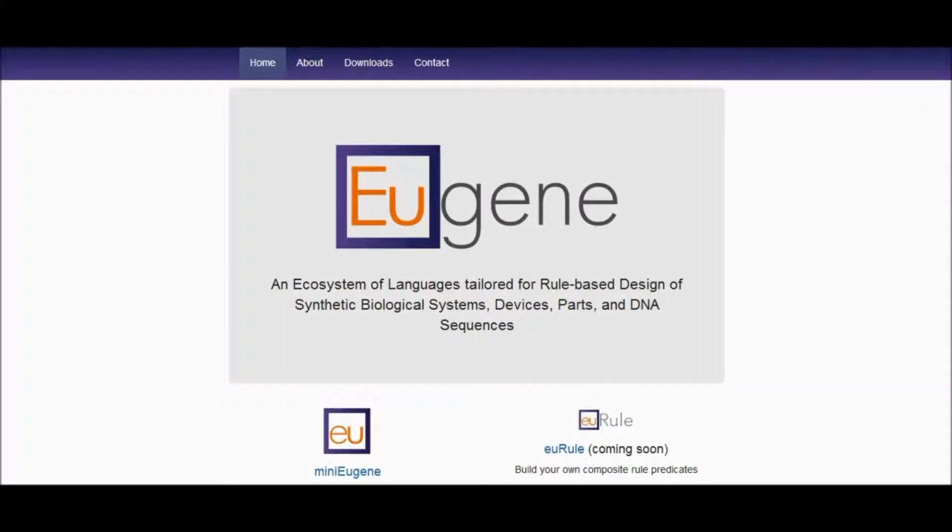Welcome to EugeneCad.org, the home of Eugene web applications. EugeneCad is an ecosystem of languages tailored for rule-based design of synthetic biological systems, devices, parts, and DNA sequences.